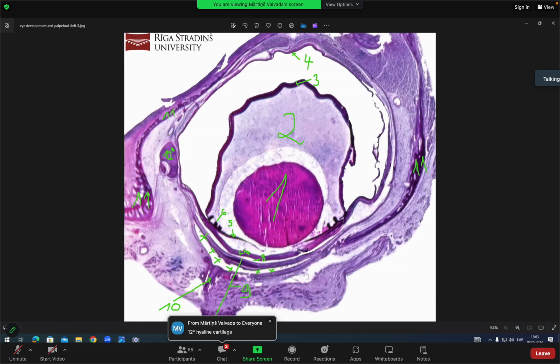In this slide, due to the magnification and staining, it doesn't look that great. It's very blurry, but if you would check this with your own eyes at the microscope, you would see hyaline cartilage. This slide, unfortunately, is not on the slide plate here, or we'll need to recheck at the end of the class, but this is a small hyaline cartilage fragment. It can appear in some slides. Okay, this is just a variation. Let's check some other slides.